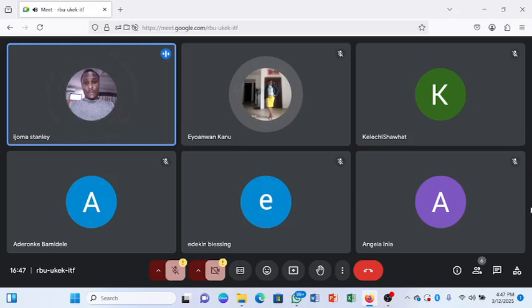So it's usually collected using a universal bottle. I mentioned this universal bottle earlier for collection of urine, sputum, and feces. Use this universal bottle. It's bigger than the normal bottle for collection of blood.